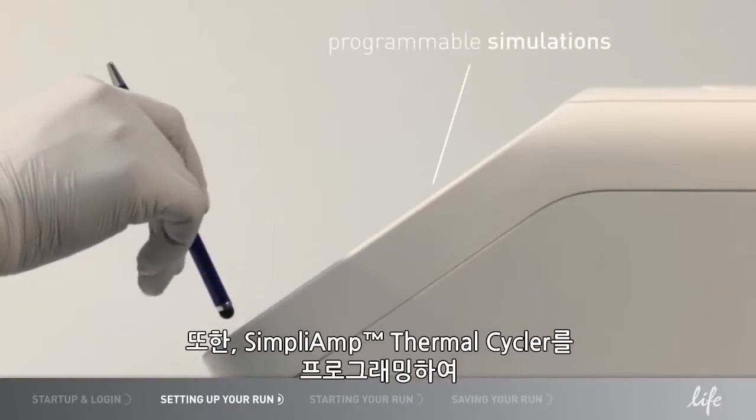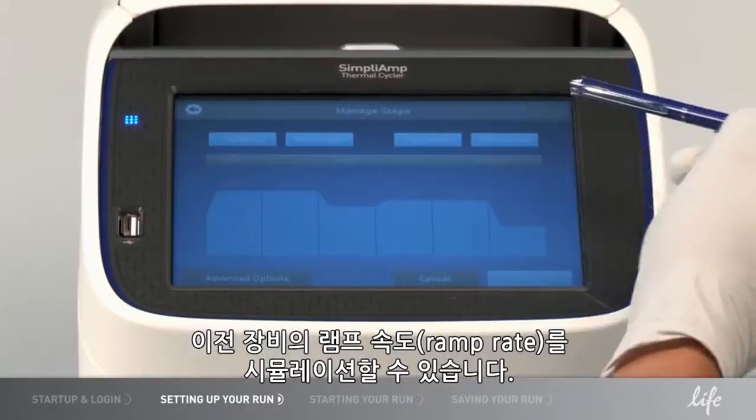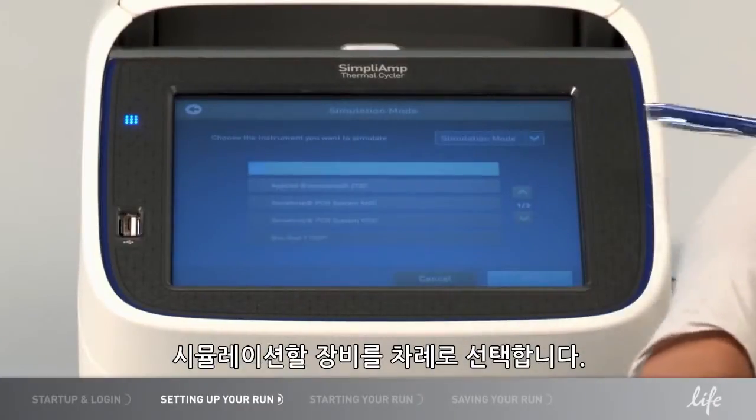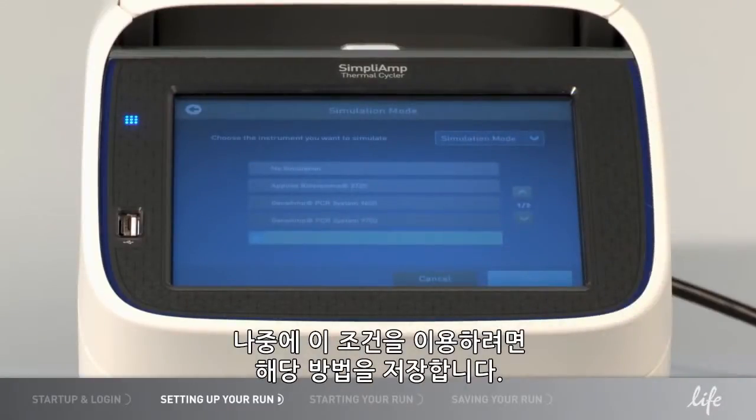In addition, you can program the Simply Amp Thermal Cycler to simulate the ramp rate of an older instrument. From the Advanced Options menu, select Simulation Modes and select the instrument you are interested in simulating. Save your method if you are interested in accessing these conditions later.